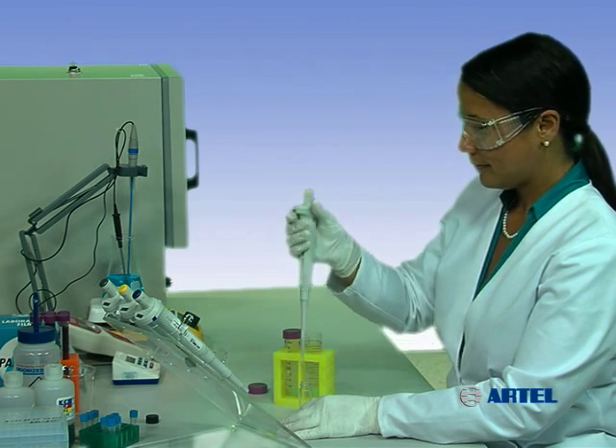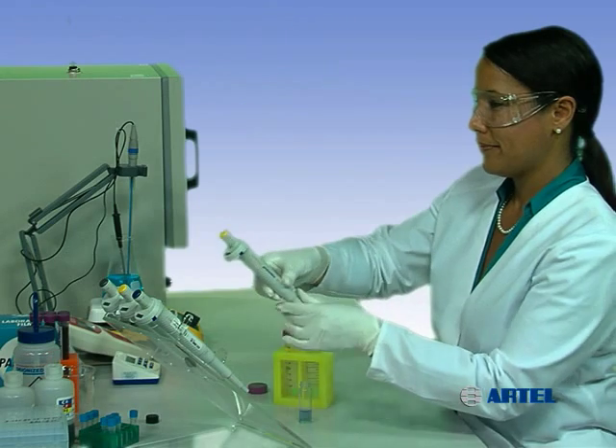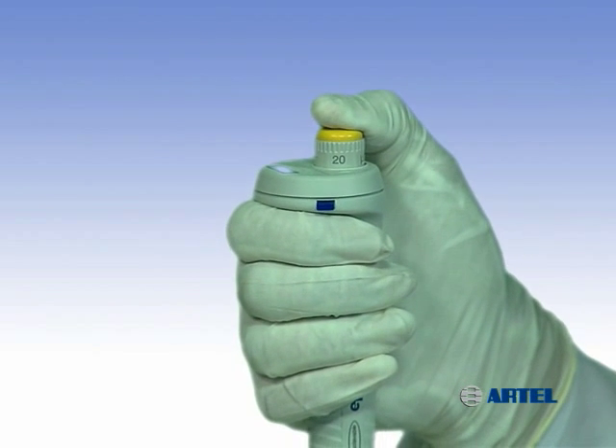Avoid this type of error by holding the pipet loosely between each transfer, or return the pipet to the stand or set it down between sample deliveries. One way to reduce heat transfer is to wear gloves.